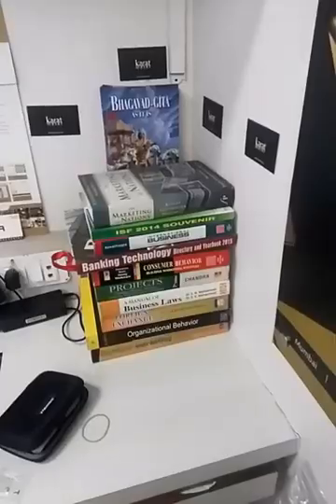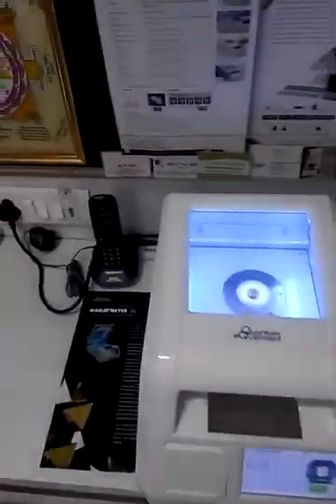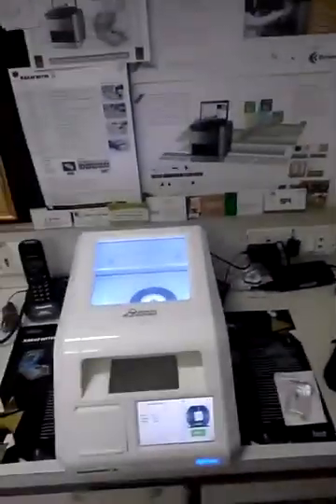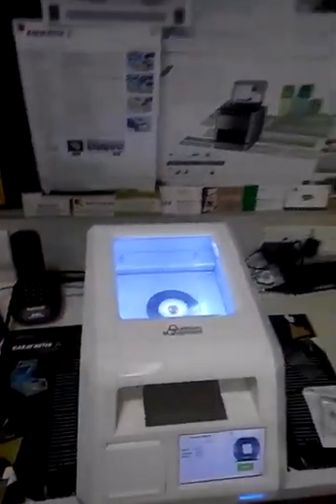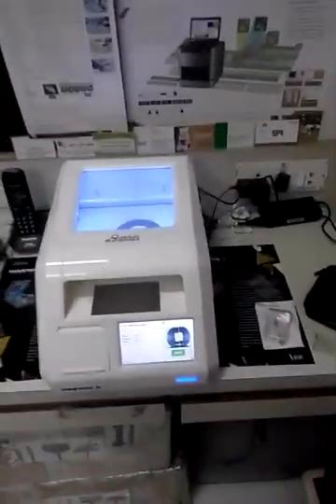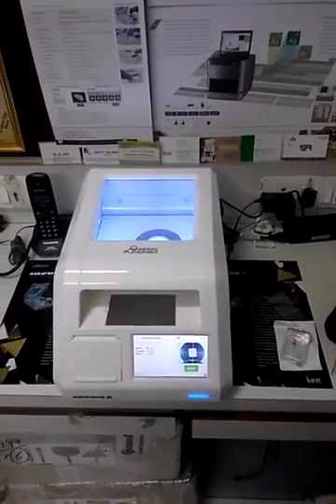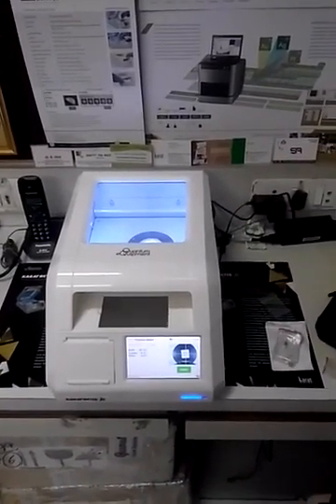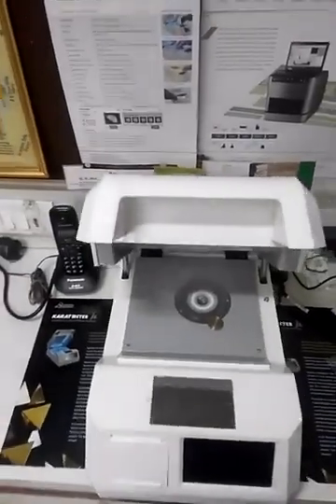My name is Mandar Shireskar. Now we move forward for the Caratmeter JL. This is a very small unit and a highly accurate unit. I will show you the unit from start to stop, so it will be very easy for all of you to understand how easy this unit is.